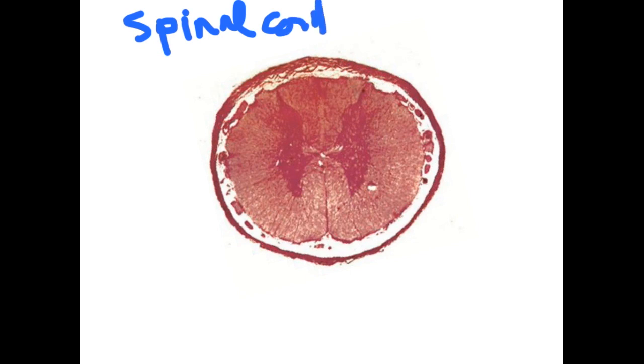Then look for the following. Look for the shape of the horns. Here the horns are more or less of equal thickness. Here this is the posterior, of course, because it has a connection with the surface of the section, this connection, and this is the anterior. So the posterior together with the anterior are almost similar to each other. And very important, here we have no divergence for the posterior horns. You see here that the posterior horns, the area in between, are almost at right angle. This is a right angle and this is a right angle. So this is the thoracic. The four horns are equal and the posterior horns are almost parallel to each other, and the four horns are thin, very important. So this is the spinal cord, thoracic level.